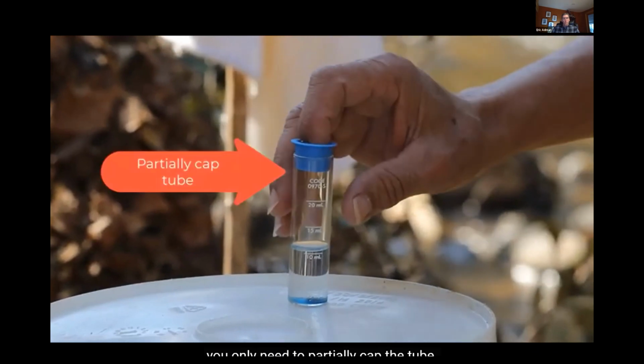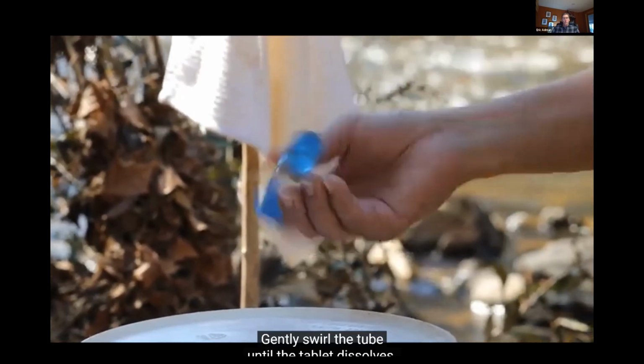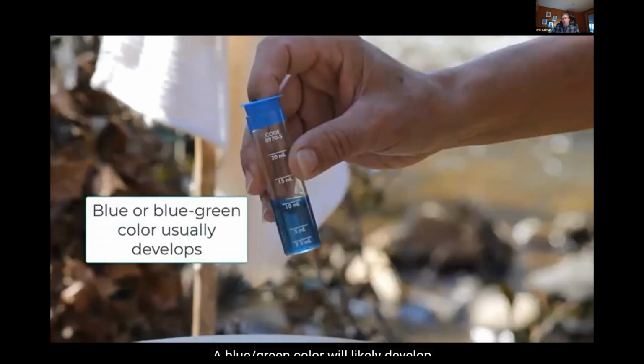You only need to partially cap the tube. Pressing the cap down completely on the tube could cause the glass tube to break. Gently swirl the tube until the tablet dissolves. A blue-green color will likely develop as the tablet dissolves.